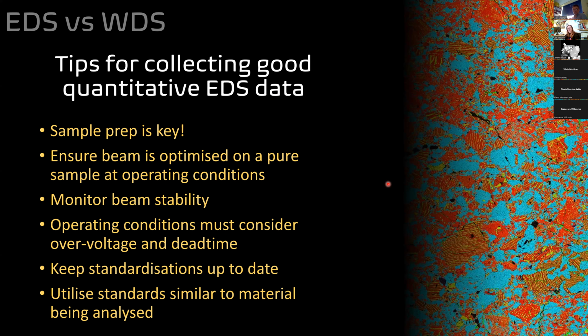So that's kind of like my little spiel about Quant EDS, because I think it's a good technique, and I think it's proven itself, especially in recent years. There's been a lot of work by the guys over at NIST, the National Institute of Standards. There's been lots of work by other researchers as well as the manufacturers of the EDS detectors. So it is a good technique. And if anyone does want references and citations around that, let me know. I've got a whole list of them. There's some really, really useful things out there.